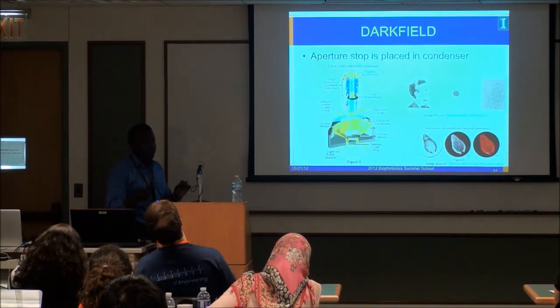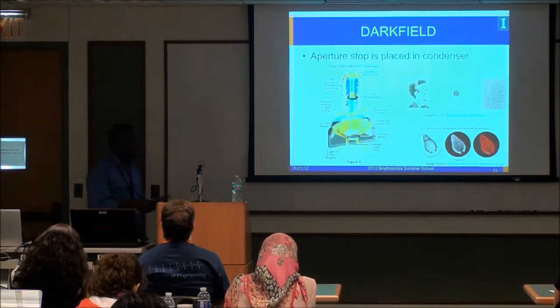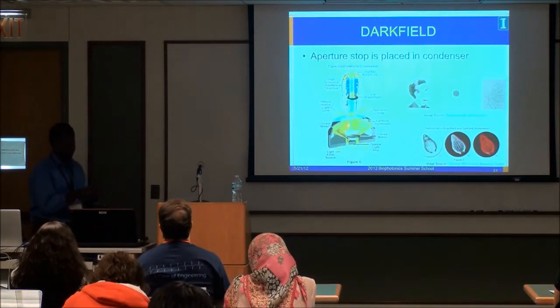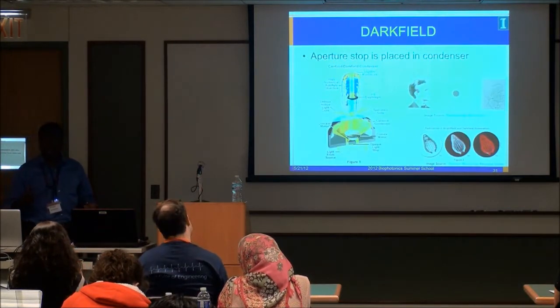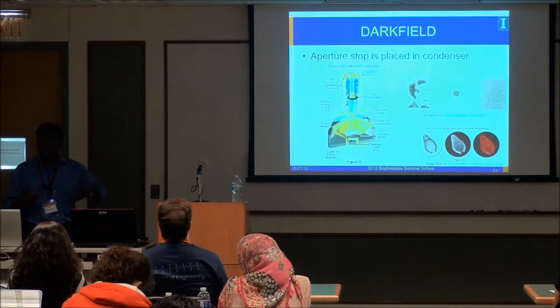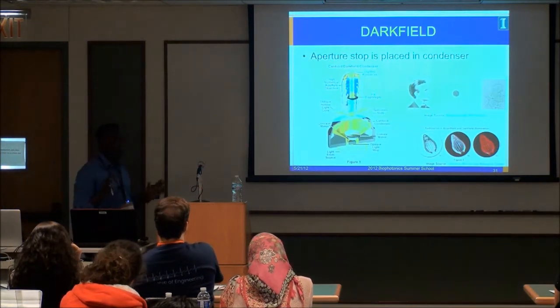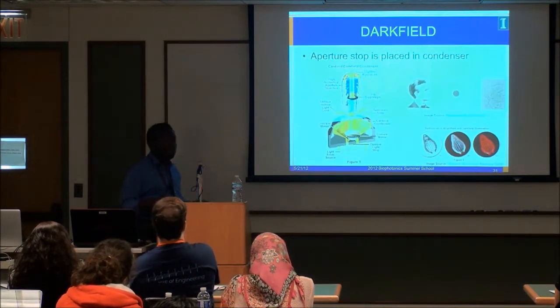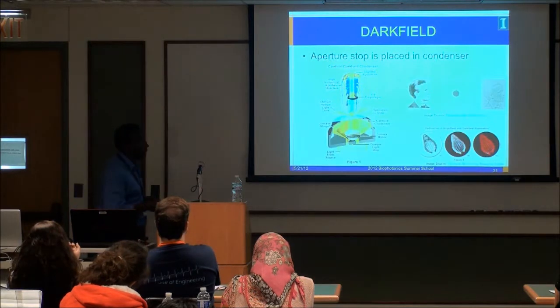There are tricks depending on how low the contrast of the system is. People have talked about making a simple dark field microscope themselves by taking some black electrical tape, playing around with the diameter, and putting that in the condenser. You can do different tricks, and it works to varying degrees depending on what you're looking at. Yeast cells are an example of a specimen to look at as well.